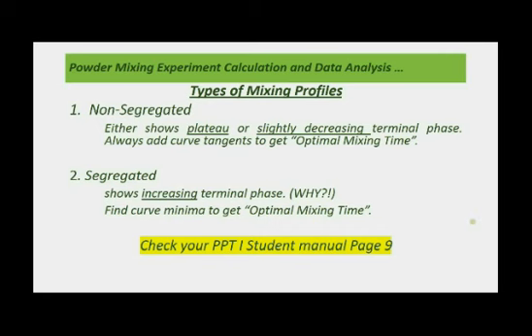Always add the curve tangents to get the optimal mixing time, while segregated mixing profiles show increasing terminal phase to indicate that the relative standard deviation or coefficient of variation is increasing upon mixing, which means that we are losing homogeneity due to segregation.